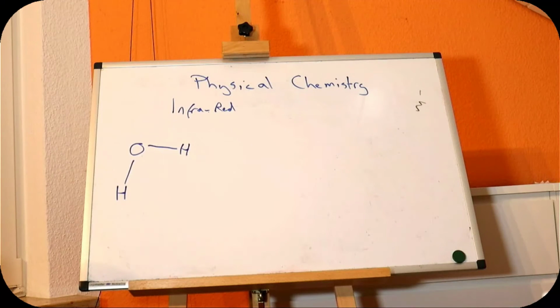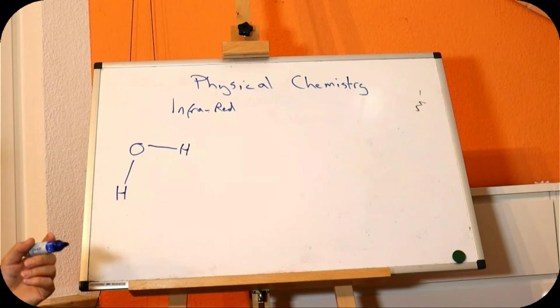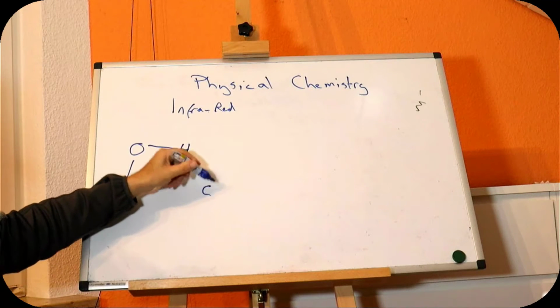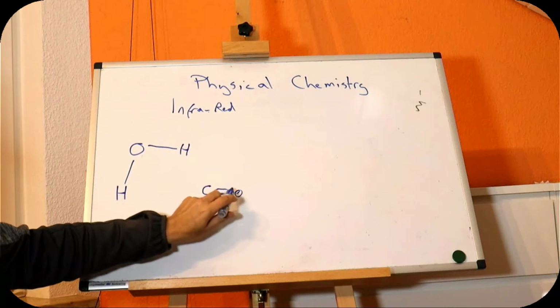So we can look first of all at the possibilities. This water molecule, for example, because it's bent, can do unfortunately everything. So let's start with something more simple. Let's start with triple bond carbon monoxide. That's not very neat.